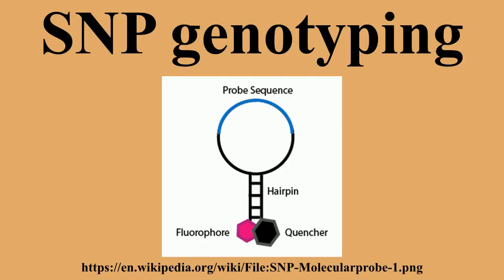Dynamic allele-specific hybridization. Dynamic allele-specific hybridization genotyping takes advantage of the differences in the melting temperature in DNA that results from the instability of mismatched base pairs. The process can be vastly automated and encompasses a few simple principles.